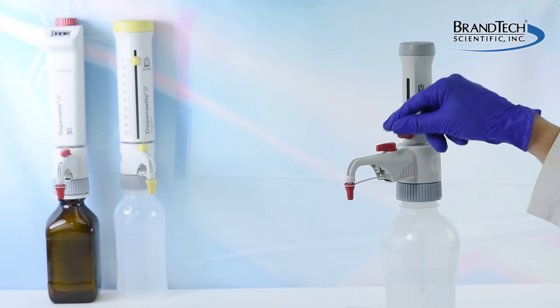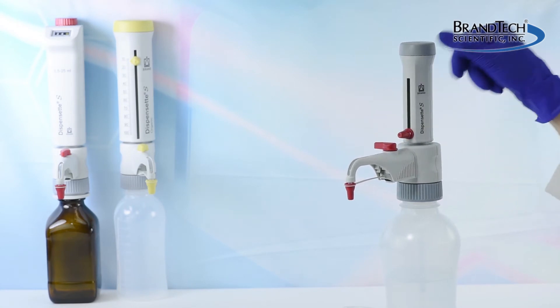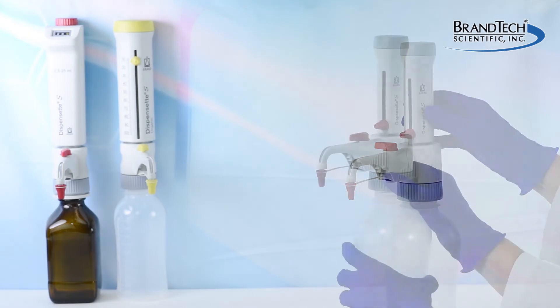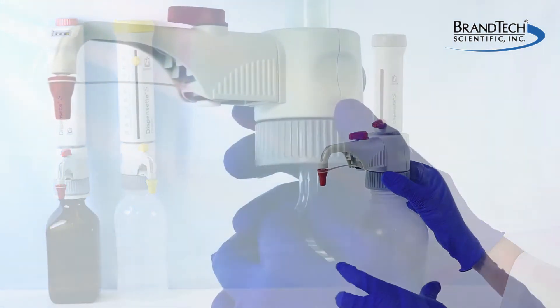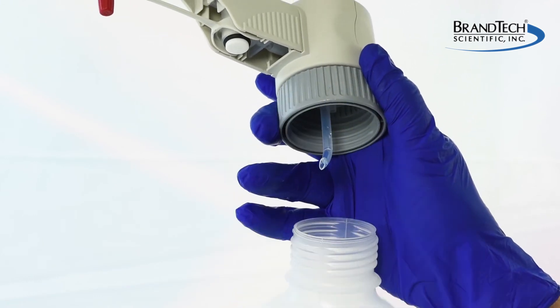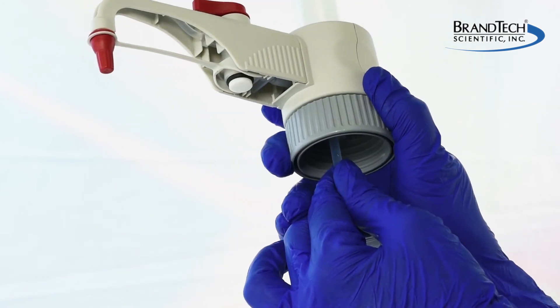If the instrument has a recirculation valve, it too should be rinsed. Remove the Dispenset from the bottle and pull out the filling tube and the recirculation tube if present.